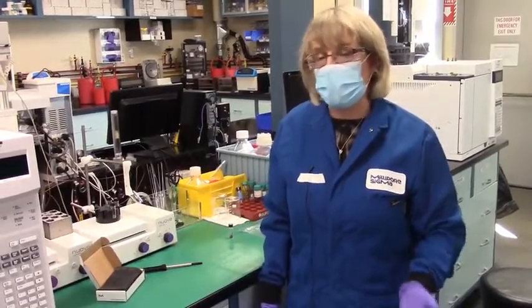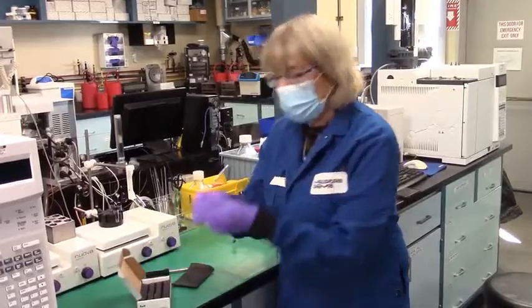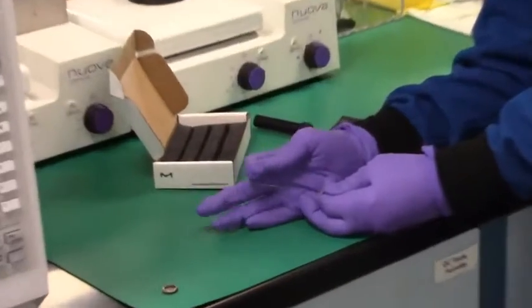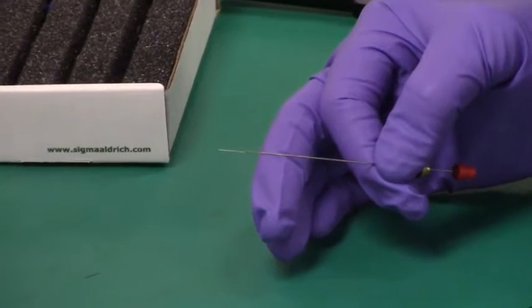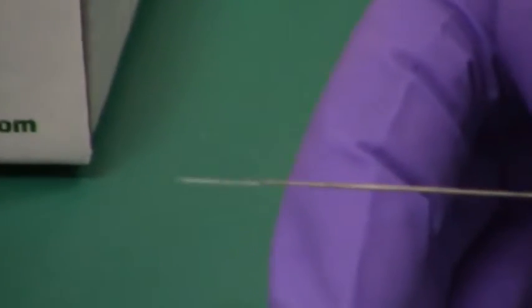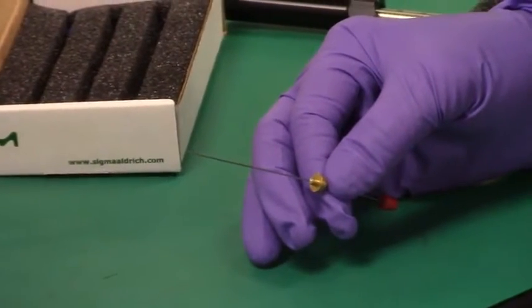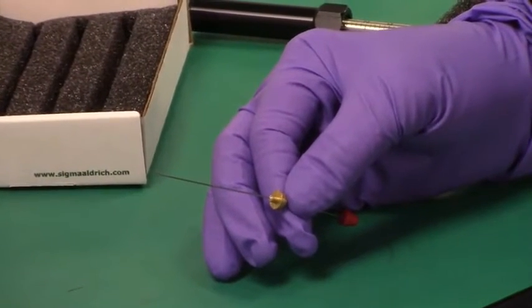So first, what is solid phase microextraction? Well, for short, we call it SPME. And the heart of it is a coated fiber device, like you see here, that contains either a polymeric coating or a particle type coating. And this coating extracts analytes from samples either through immersion directly into the sample or holding it in the headspace over the sample. And then after extraction is complete, the device is taken over and injected into a GC inlet just like a syringe, and the thermal energy of the inlet then desorbs the analytes off, and you can do your chromatography. So it's a really easy technique to do.